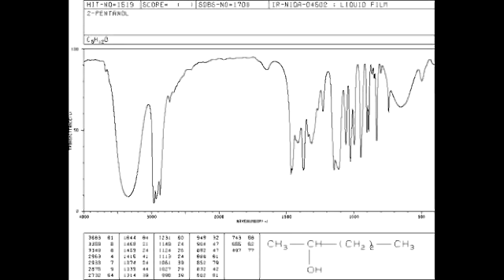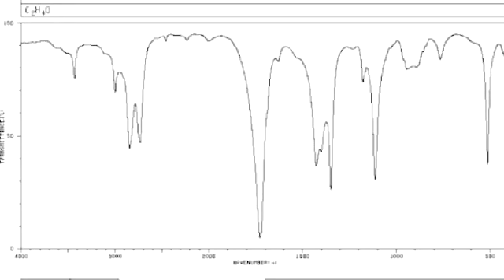Okay, let's go ahead and look at our next molecule. If you want to pause for this molecule, this is a good time. Here we can see that there's a carbonyl absorption at 1700 that's very strong and pretty sharp. That's a dead giveaway that this is a carbonyl. My thought process is, I know this is a carbonyl, but what kind?